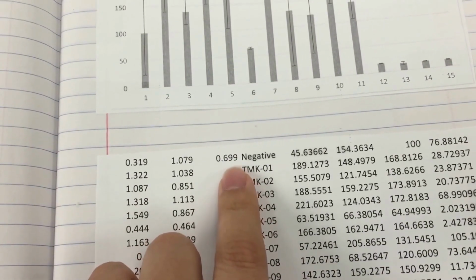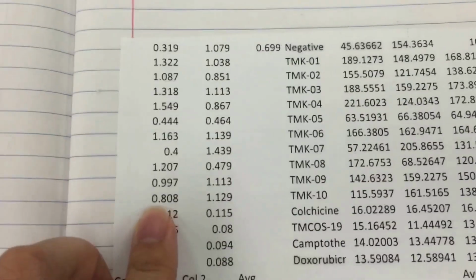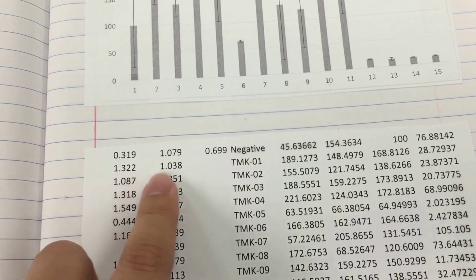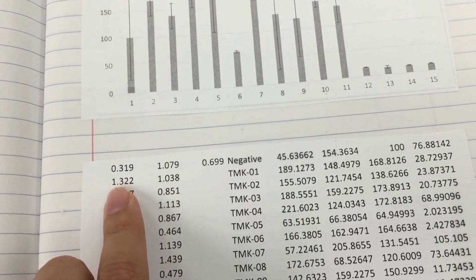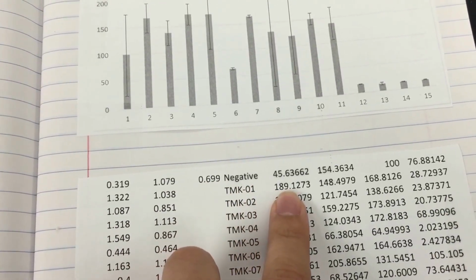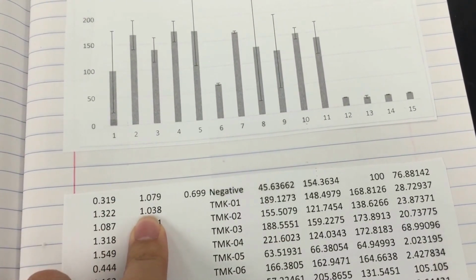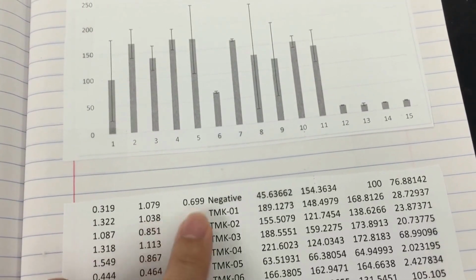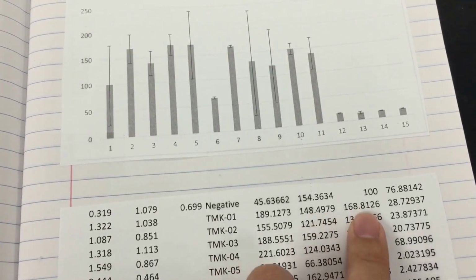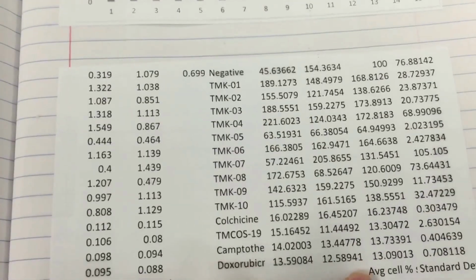And then you take this 0.699 and you divide every other value on the list, and then you multiply by 100. So for TMK1, we took 1.322 and divide by 0.699 and multiply by 100, and we got 189.1273. And then we took it for the second column and 1.038 divided by 0.699, and we got 148.49. And then you add those two and you average them, and then this would be your average cell survival.